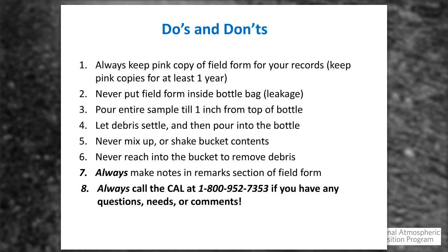Next slide, please. Don't use a funnel. General rule, do not ever use a supply that's not provided by Cal to decant your sample. Yeah, never use a funnel. We have a separate webinar on sample processing that talks about weighing the bucket and decanting the sample. It highlights things like Jeffrey noted about handling of any visible debris. But yeah, don't ever use a supply that has not been cleaned by Cal. And that's why it's really important in Section 5 on your field form to mark down the amount of any sort of contaminants in that section.